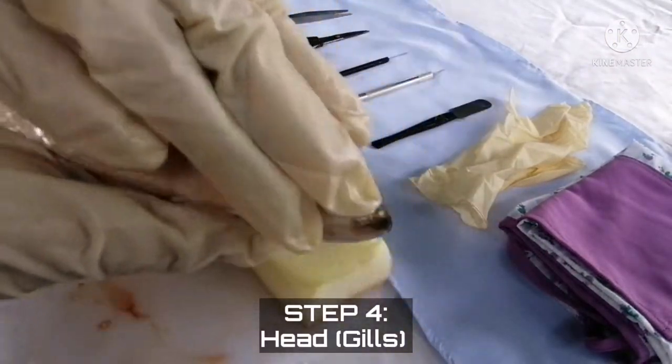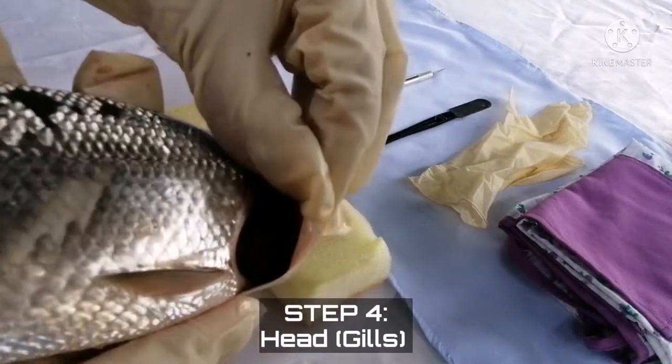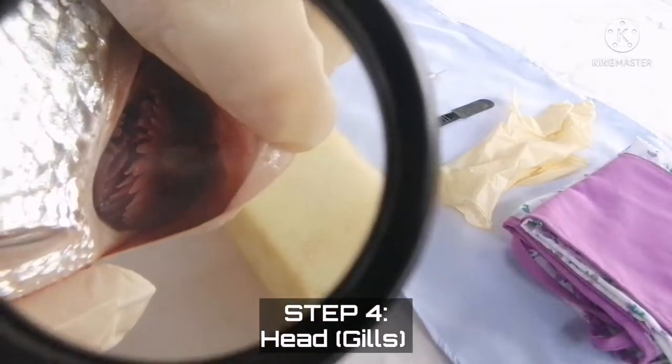They have a total of 8 gill arches, 4 in each side of the mouth cavity. Gills are the main gas exchange organ where oxygen is taken up into the body and carbon dioxide is removed via diffusion.